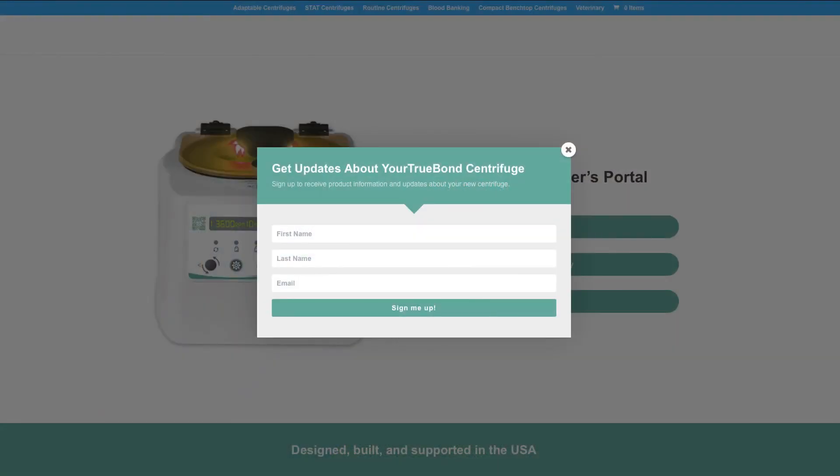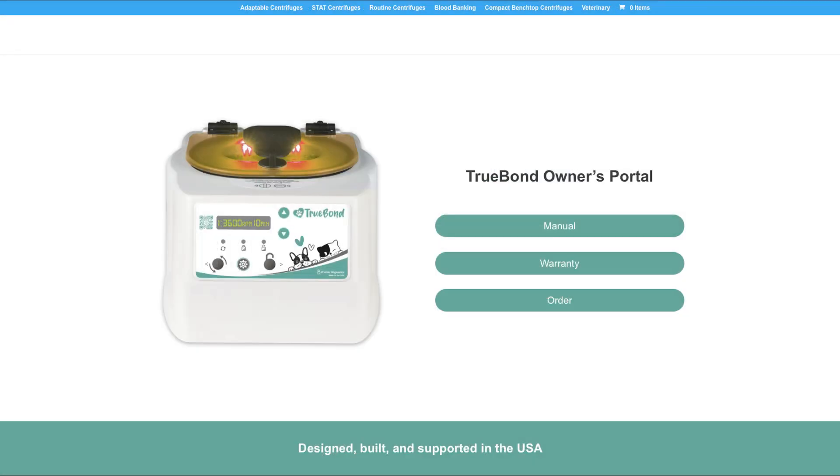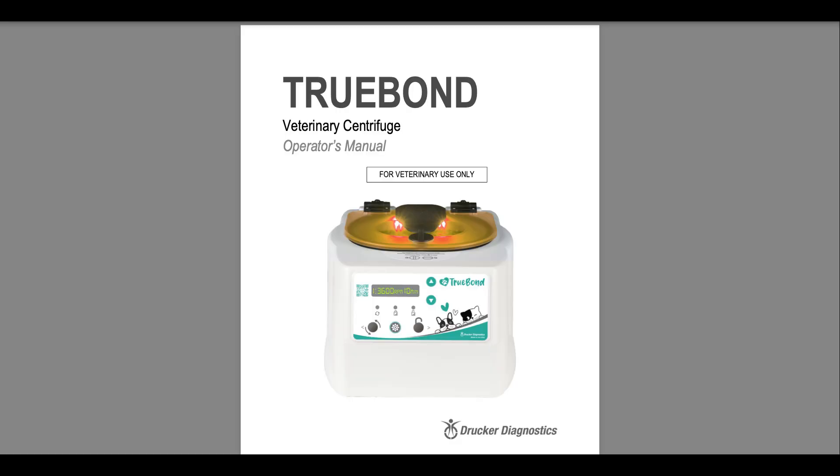You will automatically be redirected to the owners portal. You'll first see an invitation to register your new centrifuge. We recommend registration so you can receive important updates about the TrueBond. Once you've registered, you'll see a page with several different options useful to you as the owner of a TrueBond centrifuge. Click on manual to instantly access the PDF manual for your TrueBond.